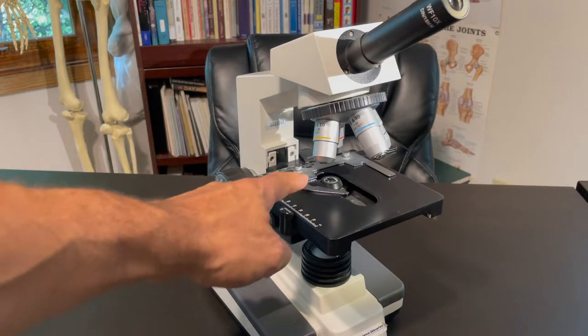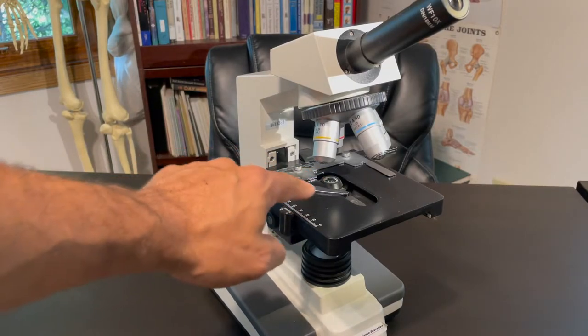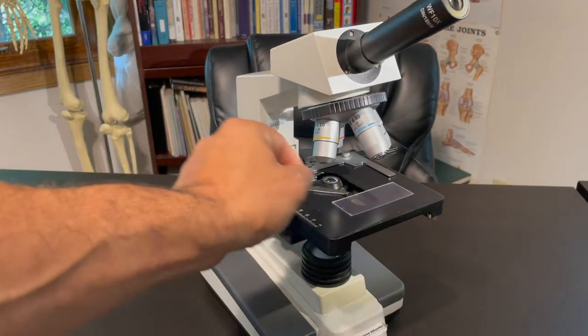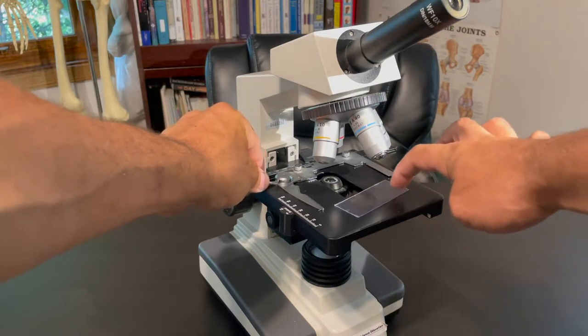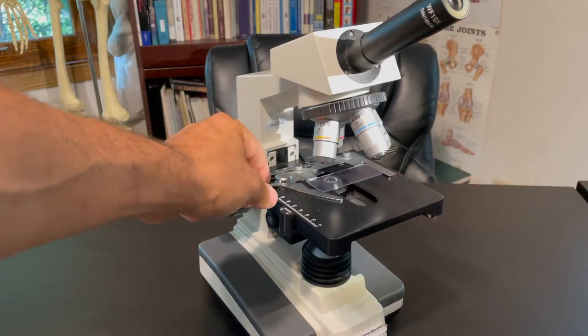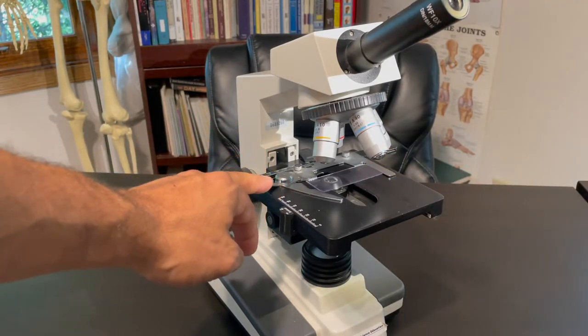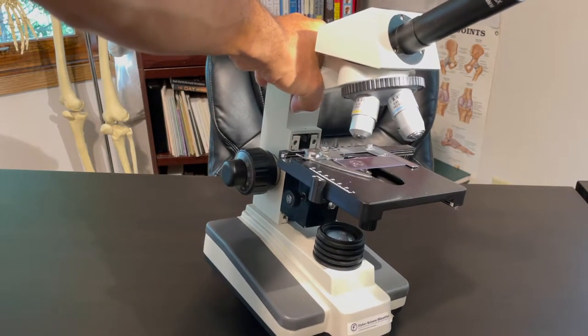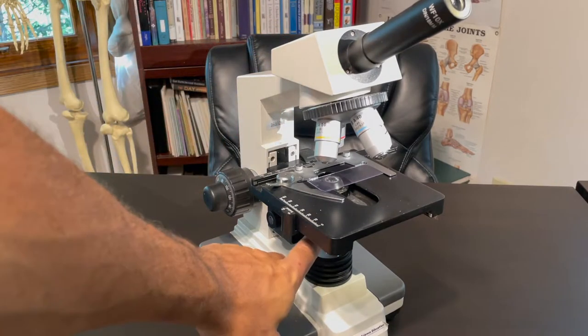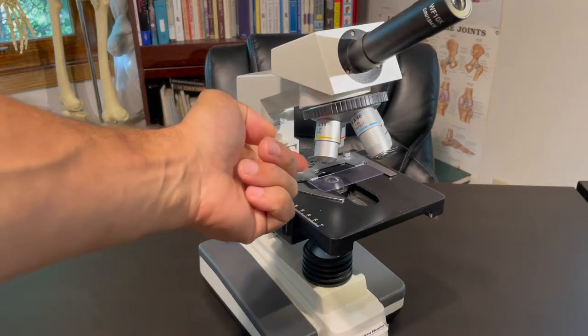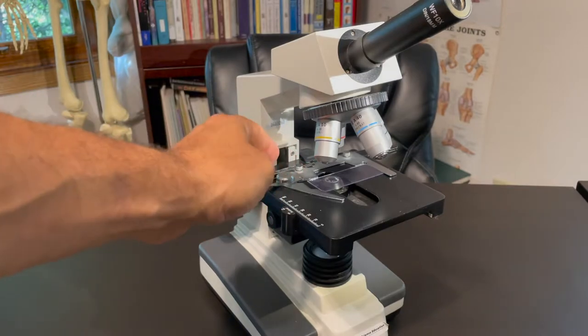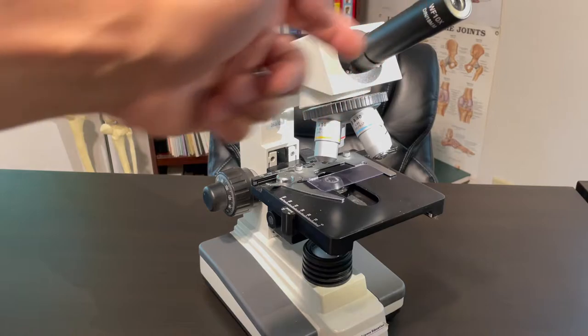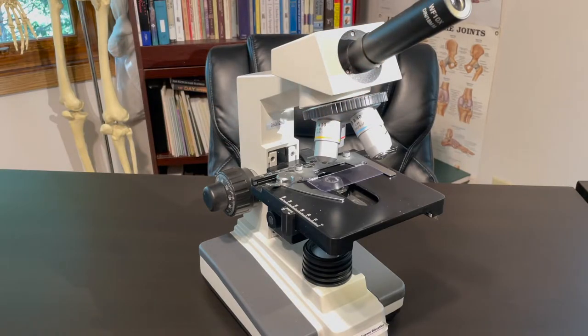You have your stage clip. This is the stage. This is the slide that you slide into and clip it in just like that. And you have your light source down here. That's what you turn on. And the light will shine right through all the way up through the diaphragm, through the stage, through the objective lens, and right through the ocular lens.